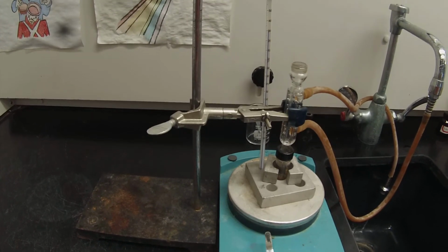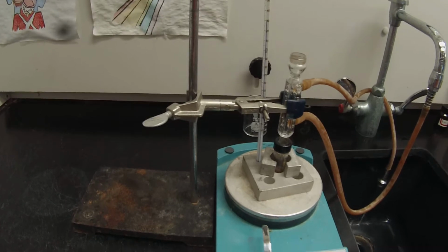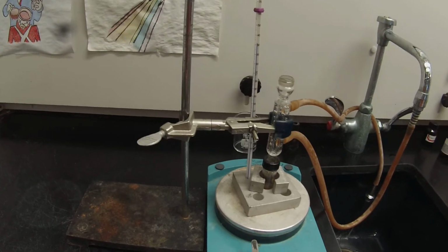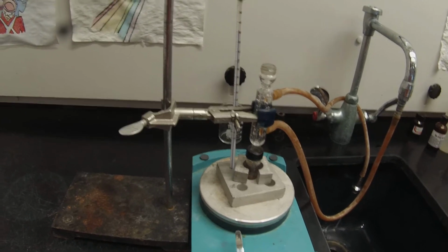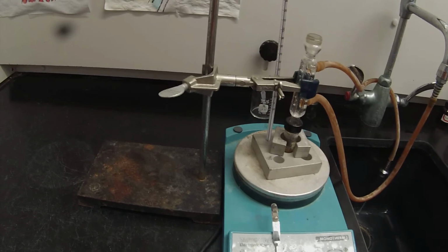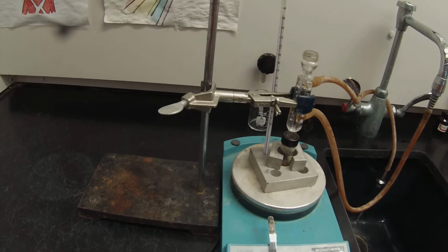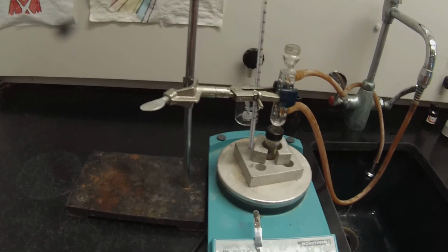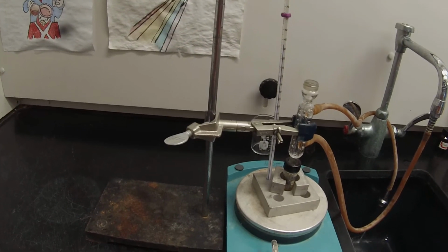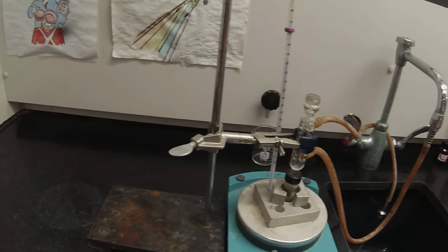And n-butyl is the shortest chain alcohol that's not fully miscible with water. Propanol, isopropanol are fully miscible with water, but n-butyl, you can actually have it float on top, and you saw that it was floating on top until I began the stirring. So I need to stir this fairly vigorously in order to make sure that the n-butyl and the concentrated acids mix well. Otherwise it'd be a two-phase mixture.